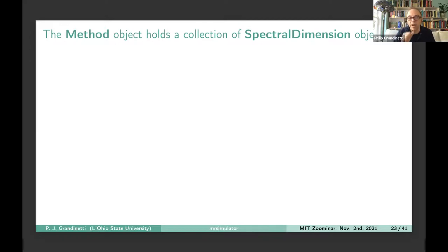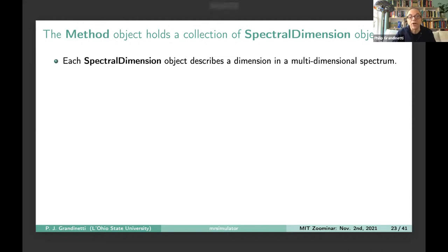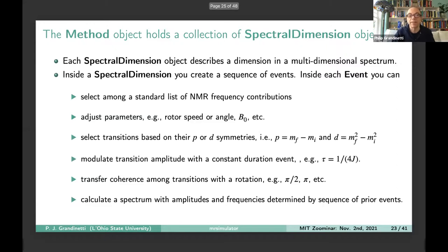The method object is where I think the power of this package comes in. In a method object, we'll hold a collection of spectral dimension objects. And each spectral dimension object will describe a dimension in a multidimensional spectrum. So if you have a 1D spectrum, you just need one spectral dimension object. If you have a 5D spectrum, you're going to have 5 spectral dimension objects in it. And inside each of these spectral dimension objects, you're going to create a sequence of events. And inside each of these events, you can do a number of things.